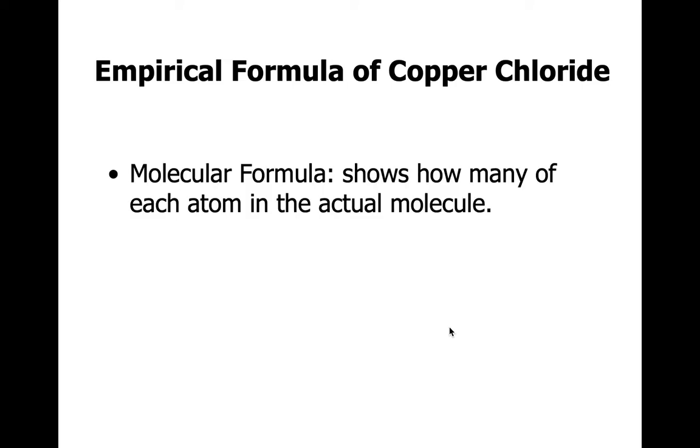Welcome to our lab this week where we're going to determine the empirical formula of a copper chloride compound. First, let's review a couple of terms. I know in my lecture we've already talked about this, but let's go over it again real quick.